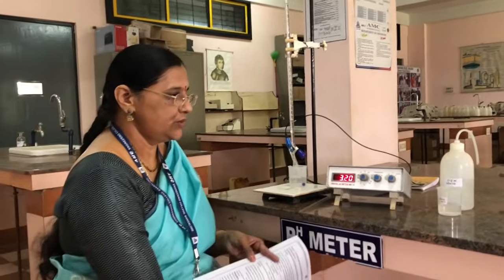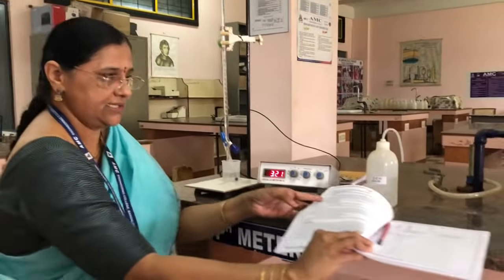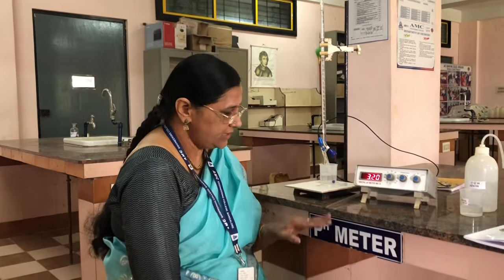In this experiment you have to understand two words. One is you have to know what is weak acid, and you have to understand what is pKa and why we are measuring the pH of the solution to determine the pKa.